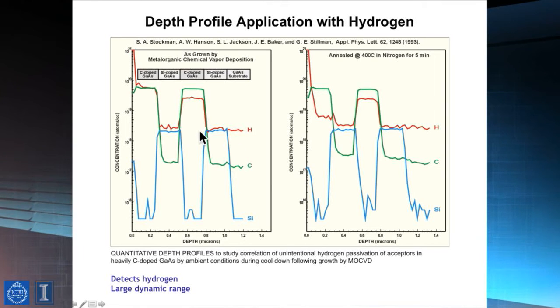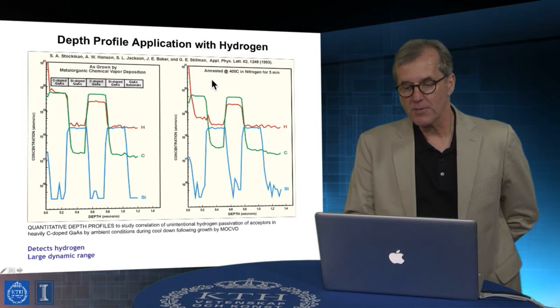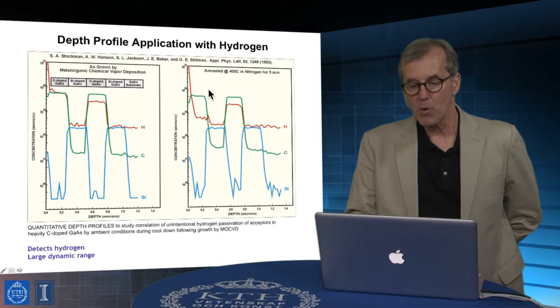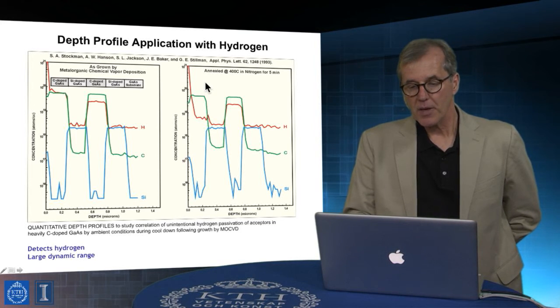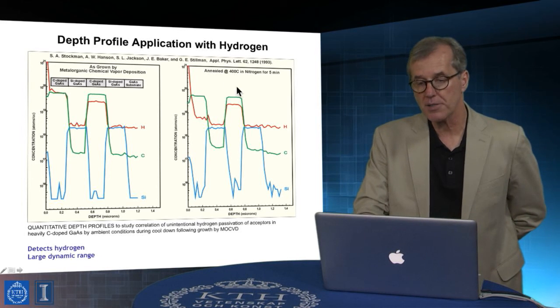And then finally, we reach the bulk gallium arsenide substrate, which has neither of these dopant-related characteristics. Here, in fact, we see something that's relatively more surprising, and that is the change in compositional profiles that comes from a form of thermal processing.